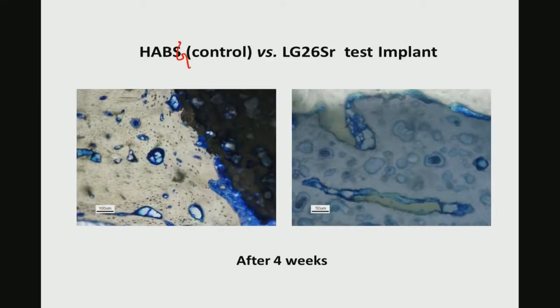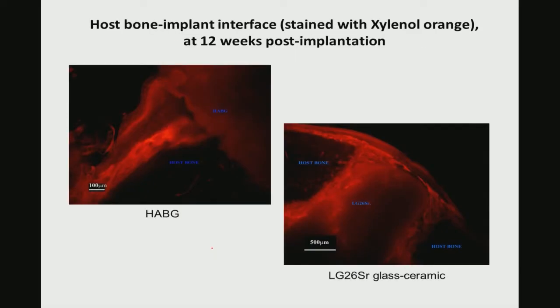So, this hydroxyapatite bioglass composition, again you can see how these cells and host tissue appear. This is your implant part and this is your host tissue part. You are just seeing the cross section image here in that optical microscope. Here you can see a very continuous implant interface, and also certain cellular features in the host tissue around the implant.